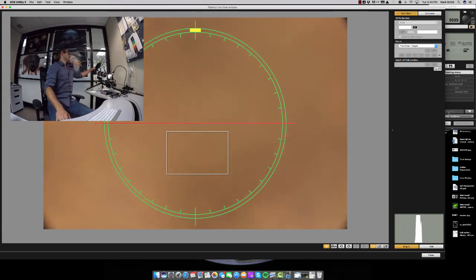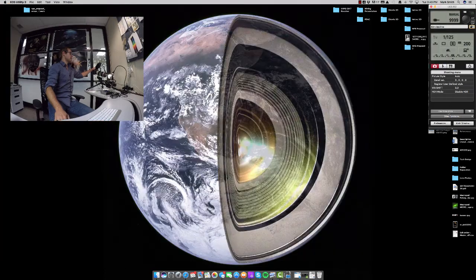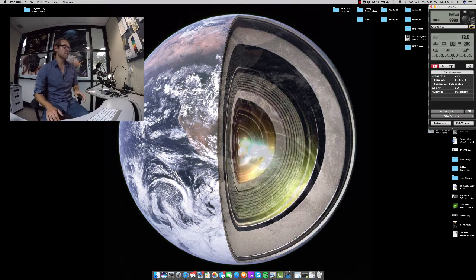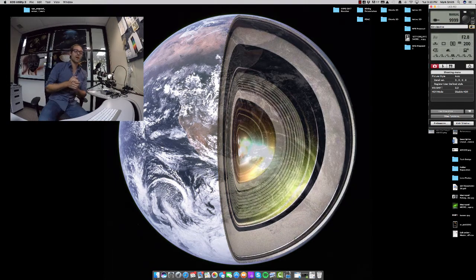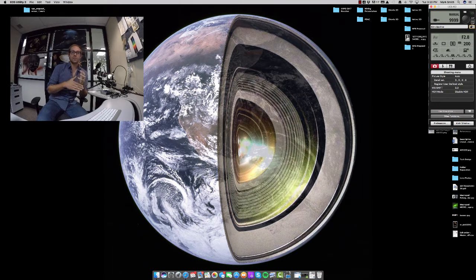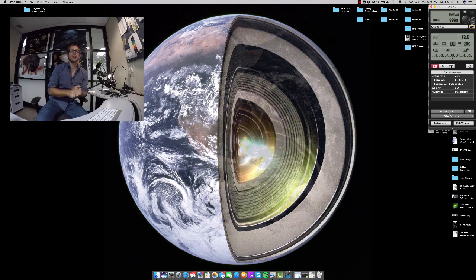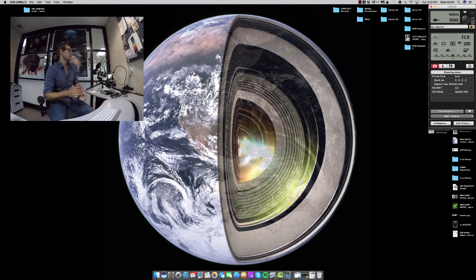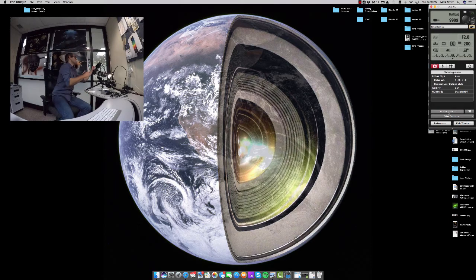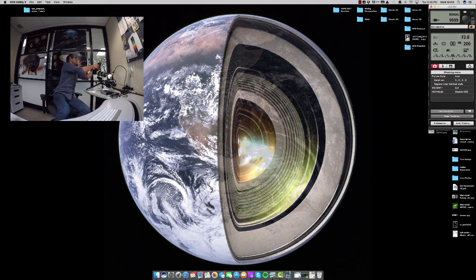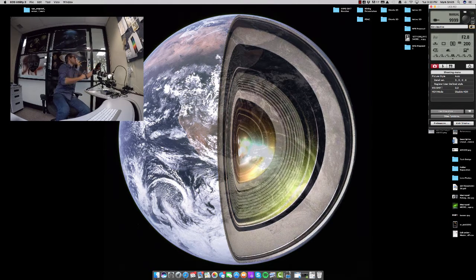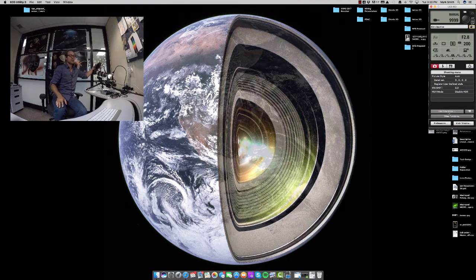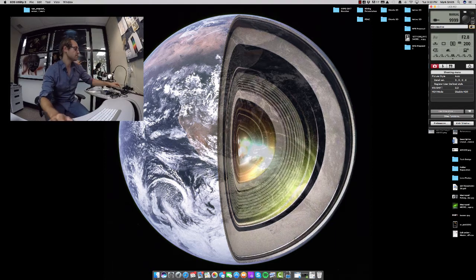What we're going to do is take the camera and set it back to manual. We're going to turn the flash on and this time, we need to basically get a lot more light onto the sample. So before we were using an ISO of 200, what I'm going to do now is increase the flash power by a factor of two. So instead of one eighth power, we're going to be shooting at one fourth power.